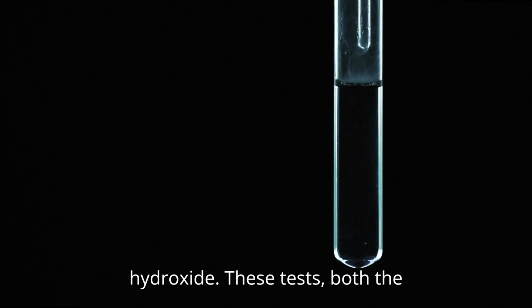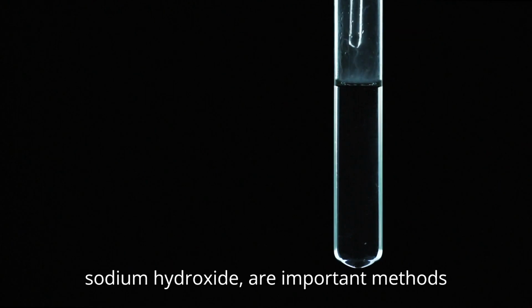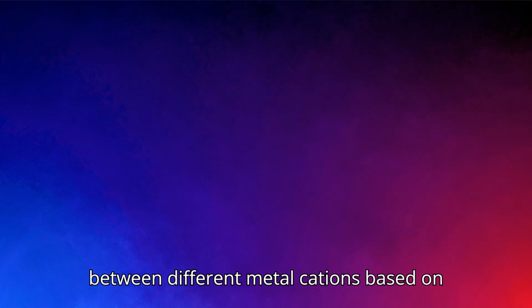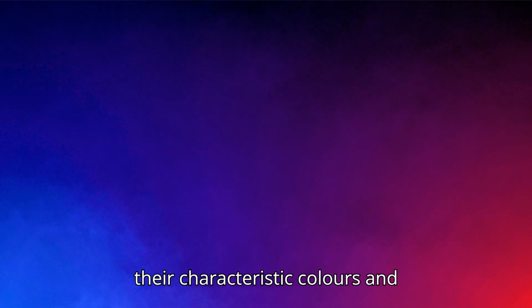These tests, both the flame test and the reaction with sodium hydroxide, are important methods in qualitative inorganic analysis, helping to identify and distinguish between different metal cations based on their characteristic colors and reactions.